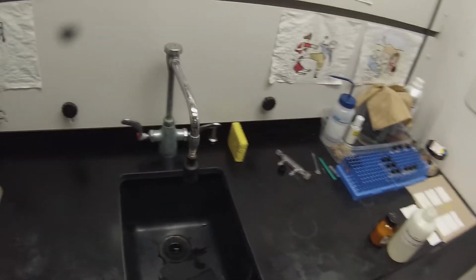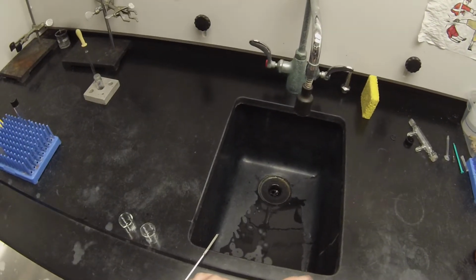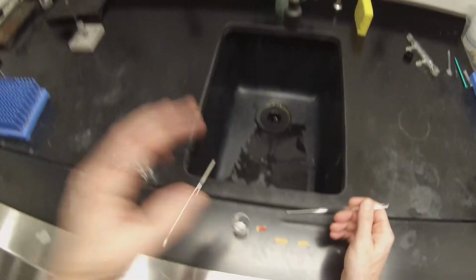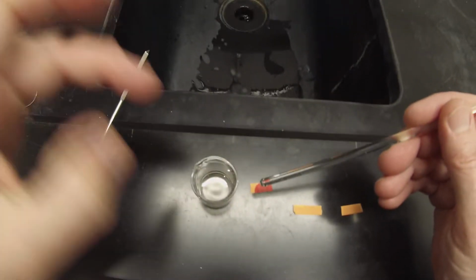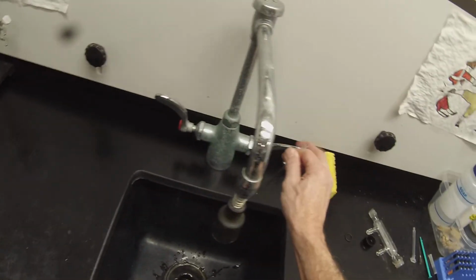Sure that was a milliliter. Yep. So while I'm waiting, let's check the pH of this. Probably still acidic. Fairly strongly acidic, as you can see. Quite red. So that layer is toast. Don't need it anymore.